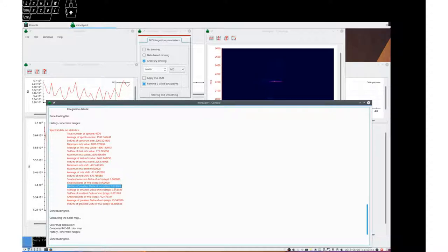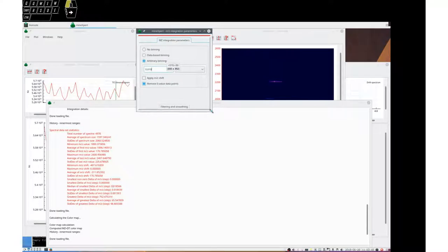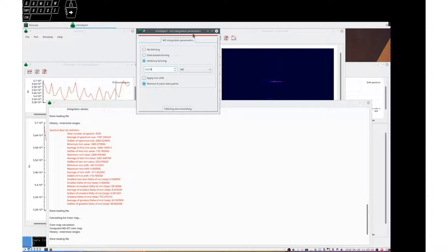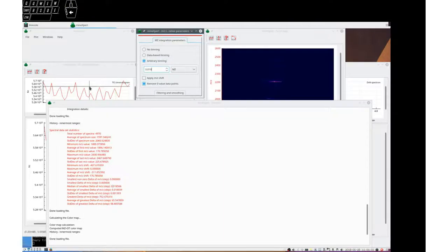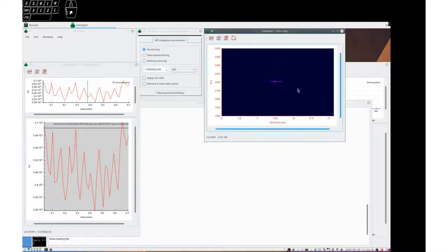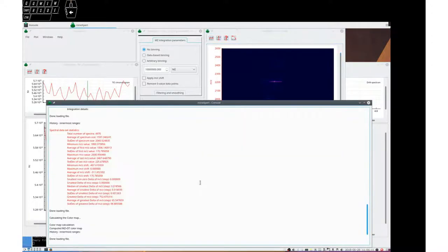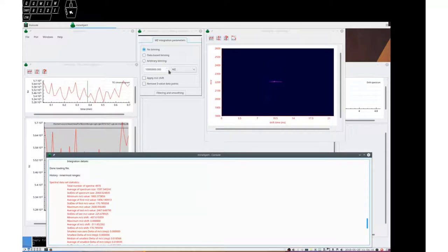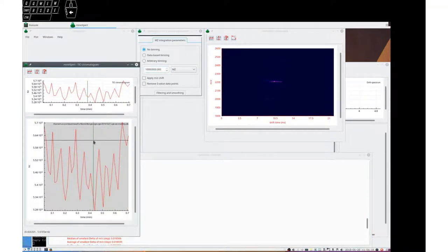And that value gets automatically inserted in this dialog box, which now I increase in size so that you can read MZ integration parameters. When performing integrations from tick chromatogram or color map to a mass spectrum, these parameters are automatically taken into consideration.